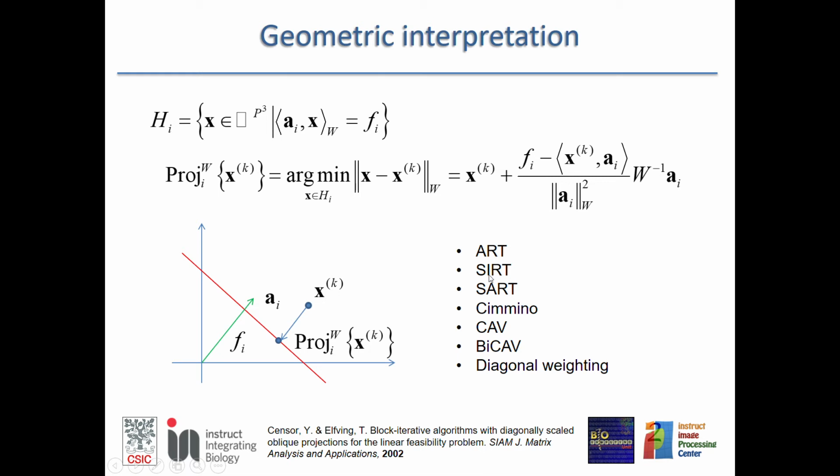But for all of them, at the end, you may think of each one of the pixels as defining a hyperplane in the volume space.